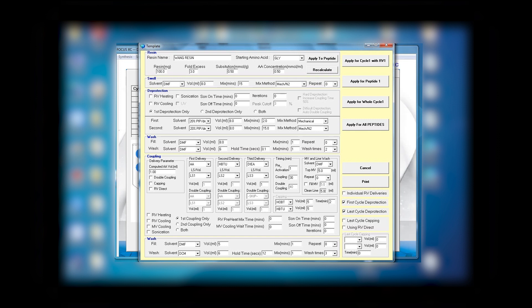We are working with only one reactor, so since it is only one reactor, we click at the upper right apply to cycle one with RV one. Remember that if you have more than one reactor, the chemistry and volume of each one can be different, or you can select apply for all peptides or apply to one peptide.